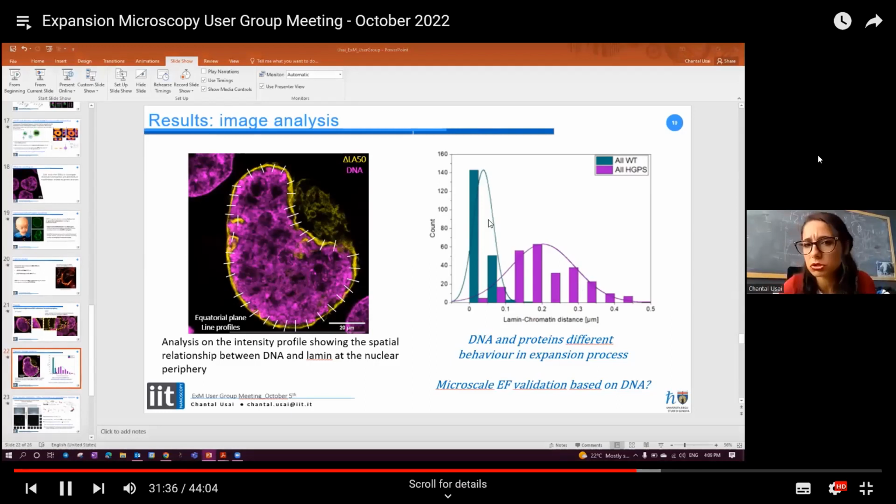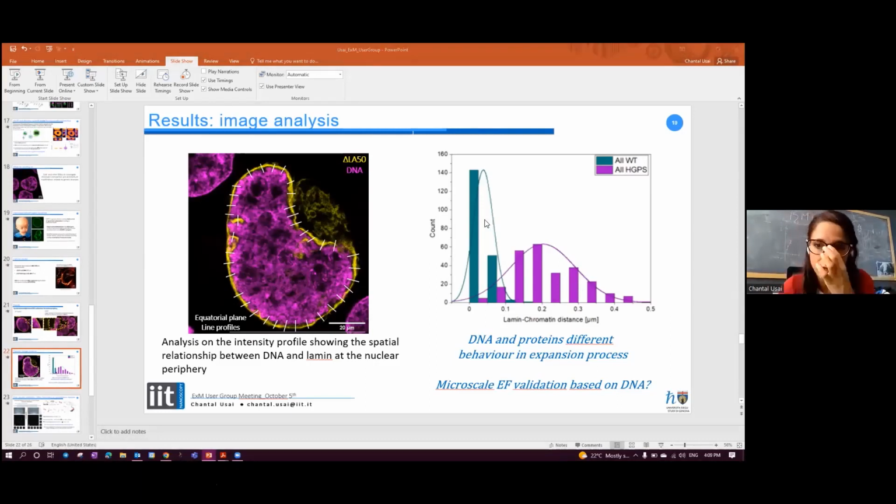The expansion is usually around the same value. Every time I measure the gel, the expansion factor I have now is usually around 4, and it is quite consistent.